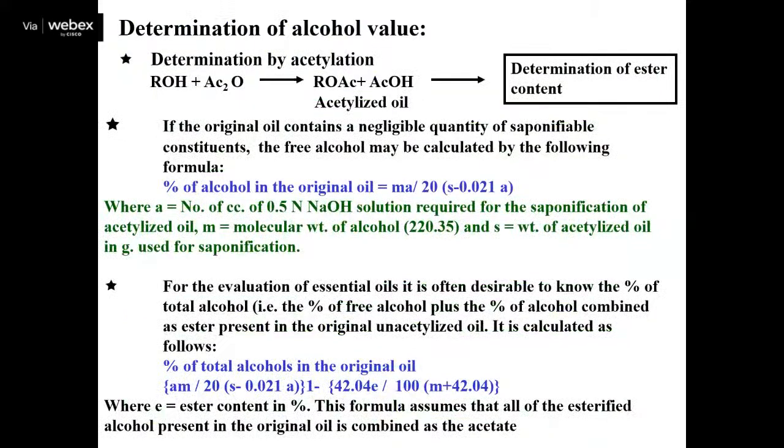to determine the ester value. The next one is the alcohol value. What is the alcohol value? Suppose in sandalwood oil, santalol content is there. So we can calculate the total alcohol content using this formula.